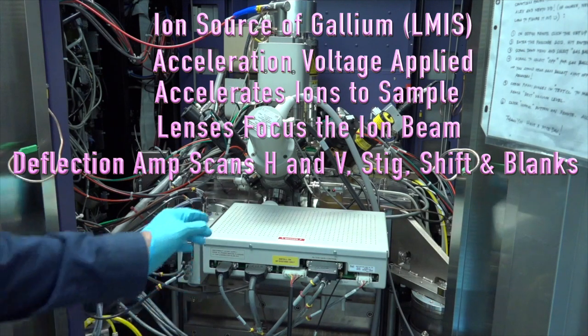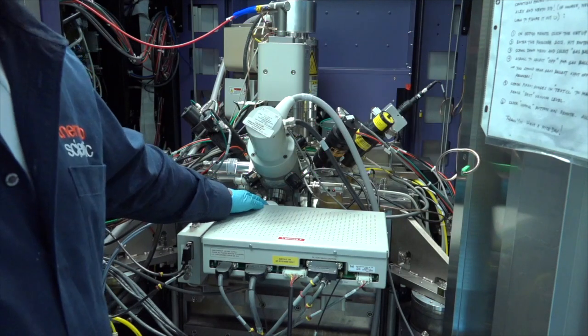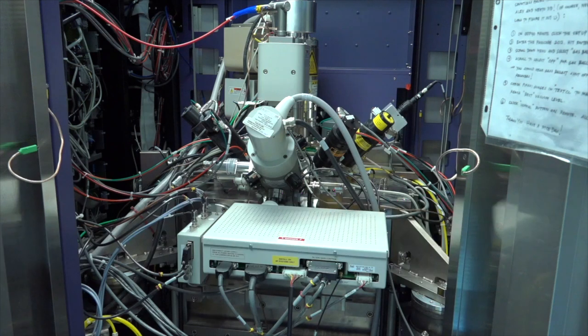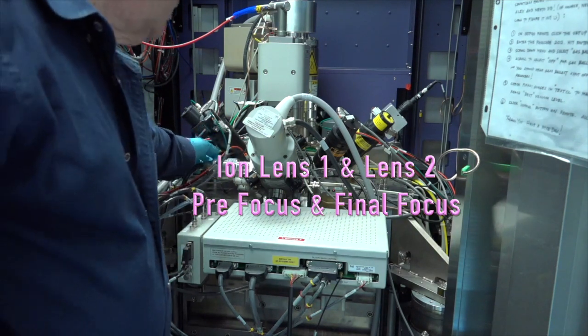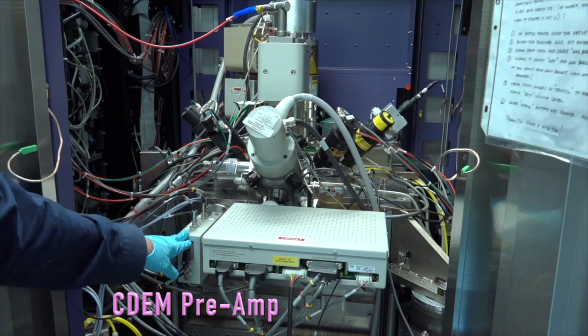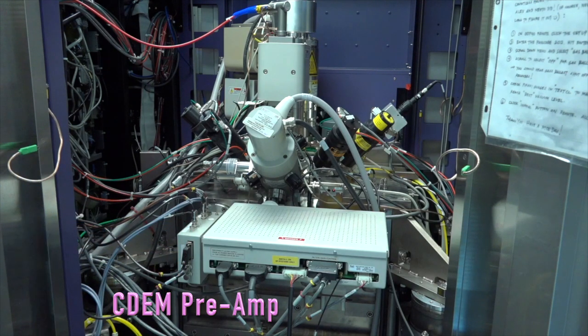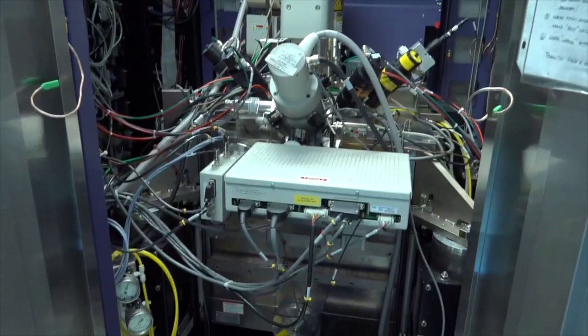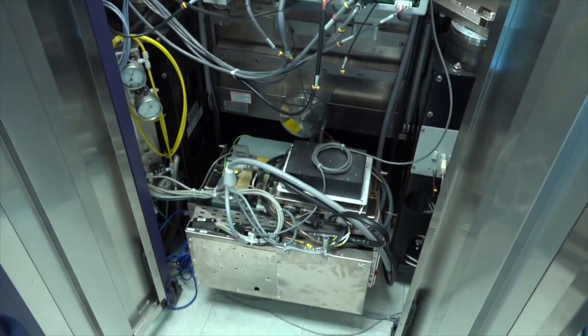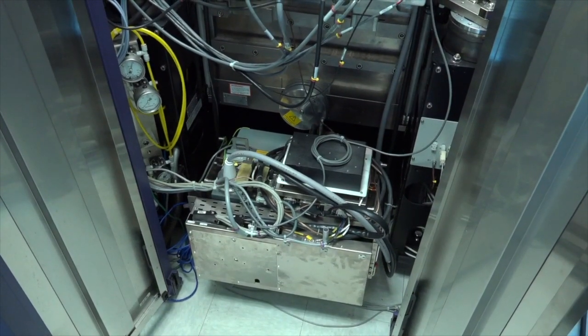On here we also have — you can just barely see the top of it here — the AVA controller: Automatic Variable Aperture strip controller. Exactly like the one for the E column, but the apertures are different sizes. Lens one is here and lens two is just below it for pre-focus and focus of the beam. And right over here you can see a CDEM detector — we'll talk about it a little bit. Below this whole level, I can show you the tank that develops the voltage for the ion column. You can see right here it's got an HTSU — the high tension supply unit — for the ion column.